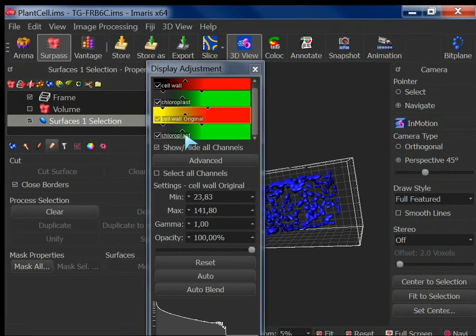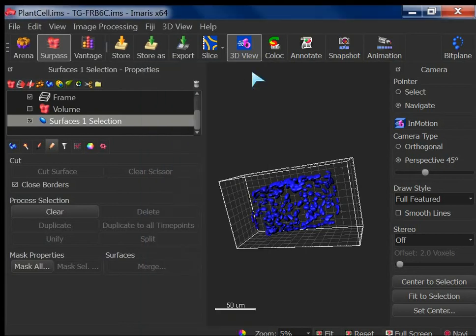But now when we go to statistics, all the numbers we have are based on the original data? We have to select that. Wait, there are two questions here. Let me finish this part. So let's say we have created this original now. I close this. Now come back to this masking option.